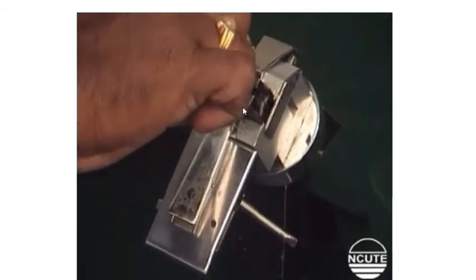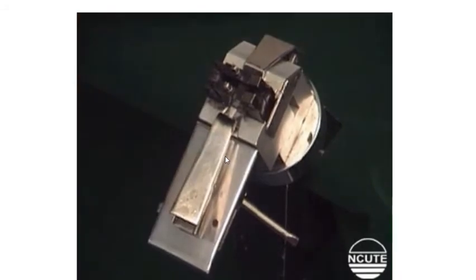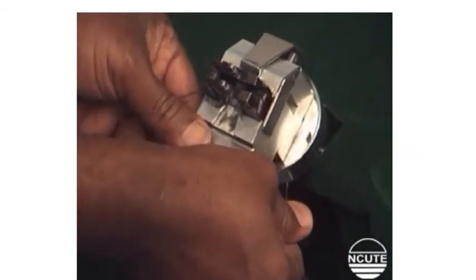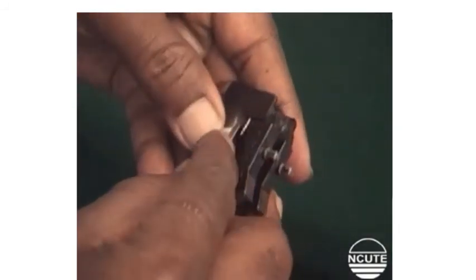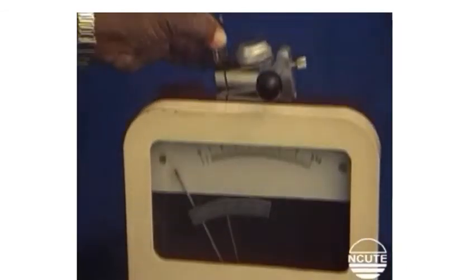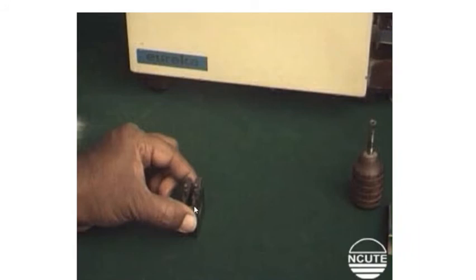This is the end point. Now the tweezer can be removed and the jaws can be pulled out and the extra fibers at the ends are cut. It is ensured that the extra fibers at the ends are cut. These are the two jaws.